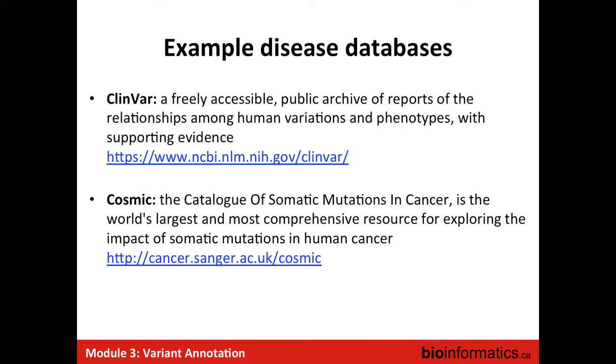But overall, this type of annotation, the frequency in population and whether a variant has previously been observed and associated with disease, are all fields that you want to fill in and add to your variant list.